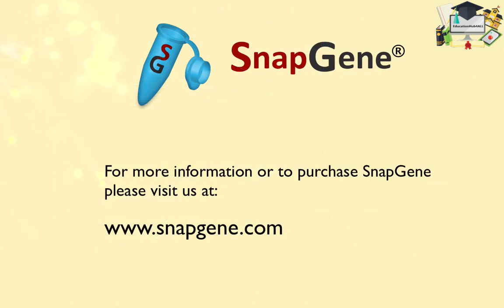As you have seen, gateway cloning is a versatile technique, and SnapGene is designed to guide you through any variation that meets your needs.